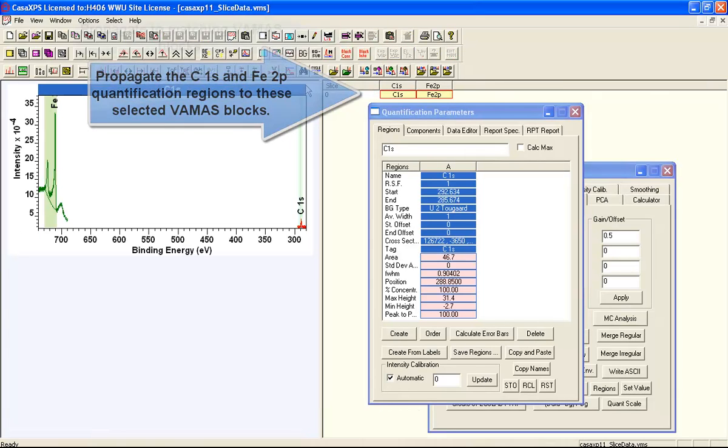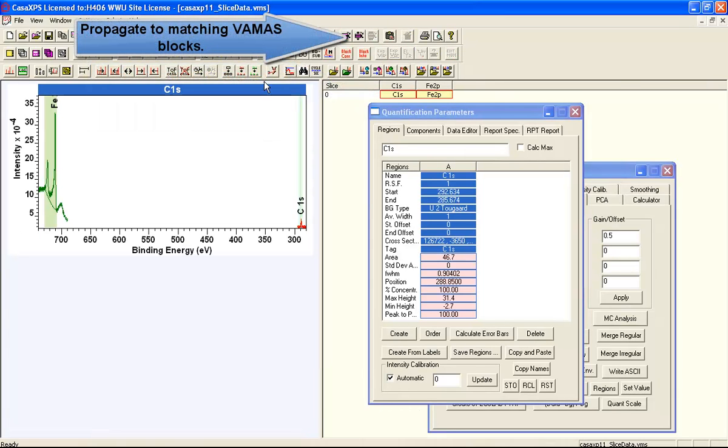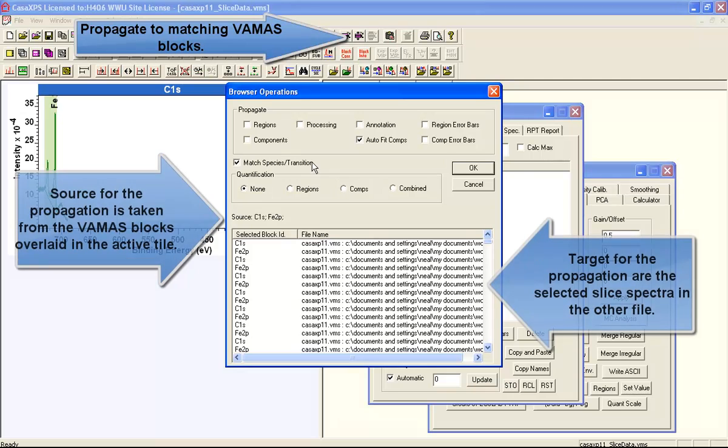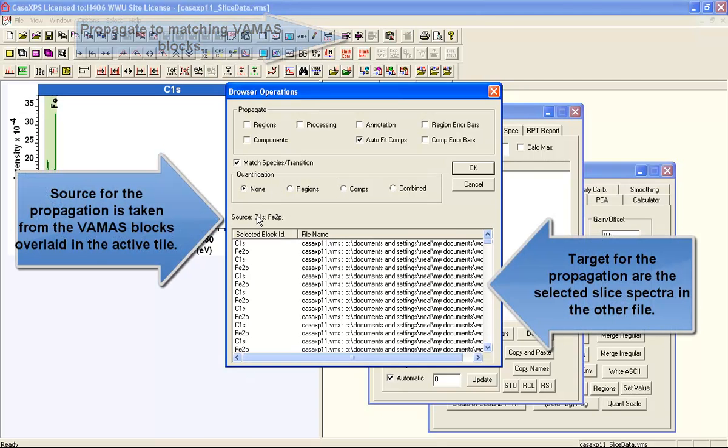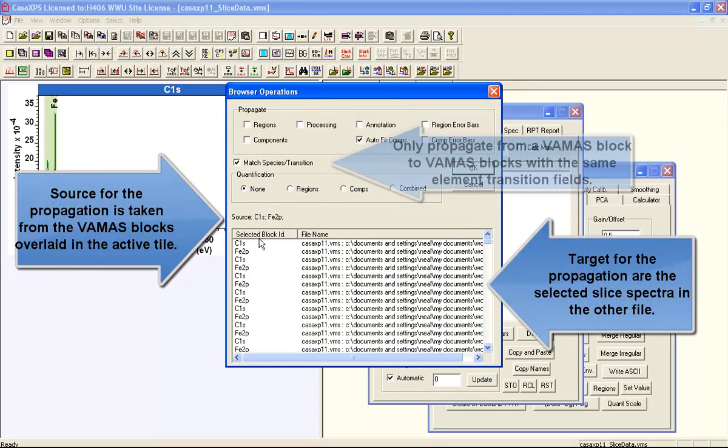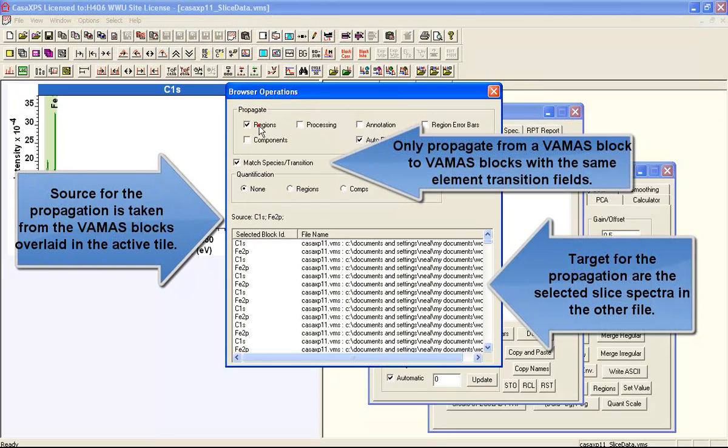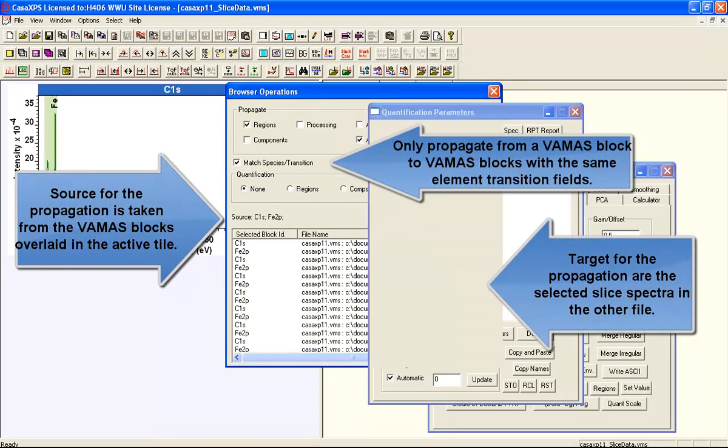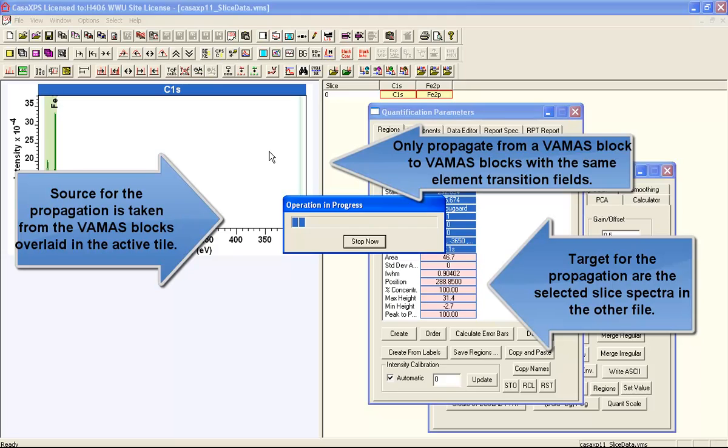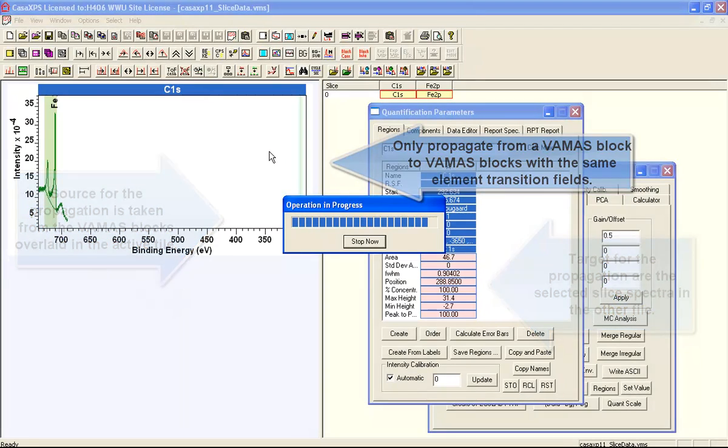Although you can sum these data as you've just seen, there is another method where you can sum based on a selection of the VAMAS blocks.